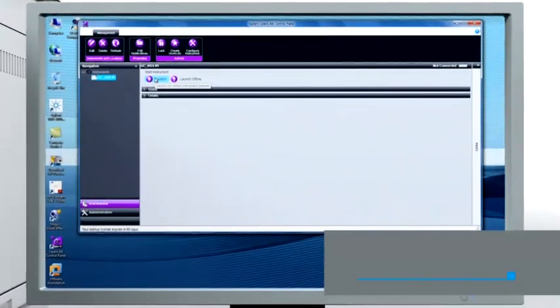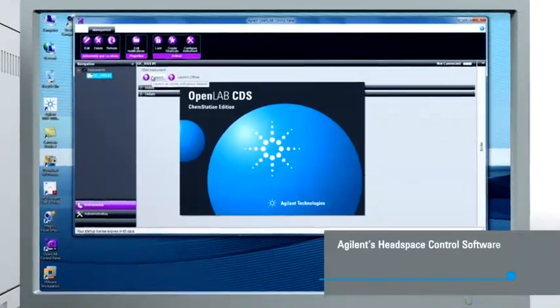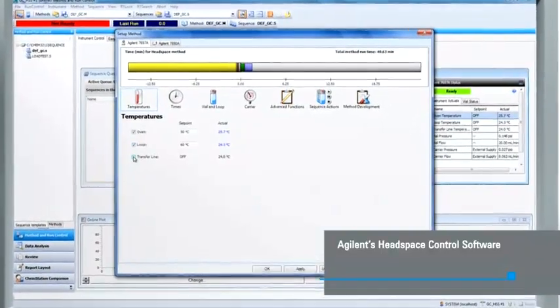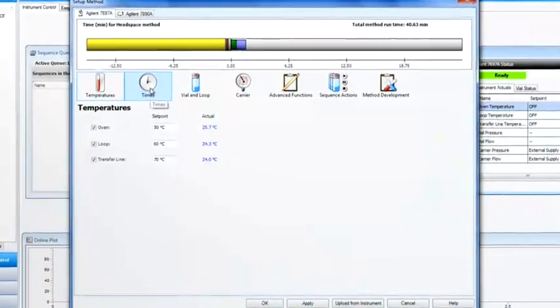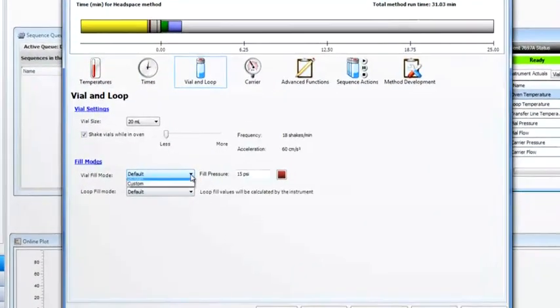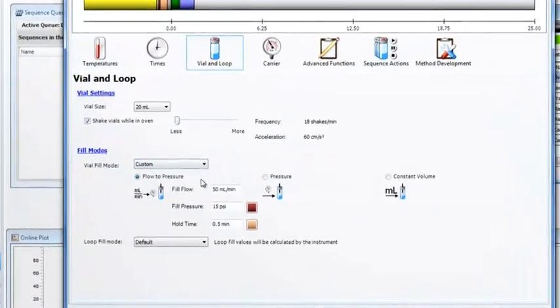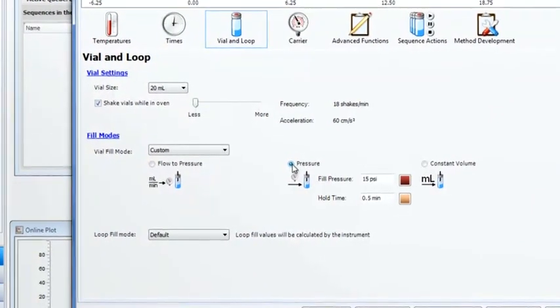The 7697A Headspace control software is seamlessly integrated with the Agilent GC and GC-MSD data systems and facilitates full control of all sampler parameters with the added benefit of method conversion and development wizards.